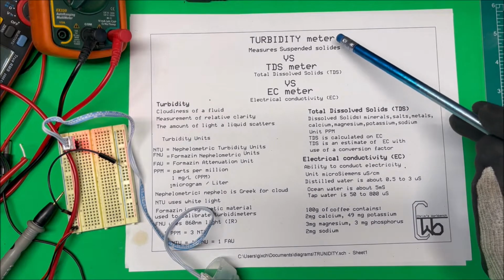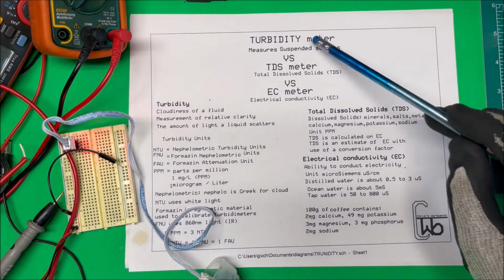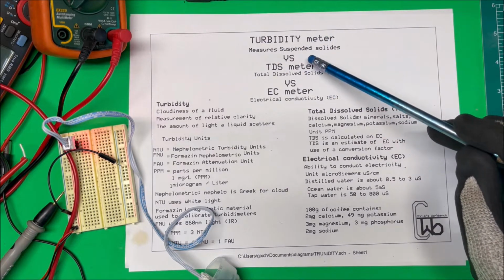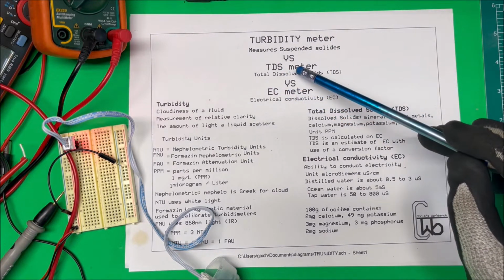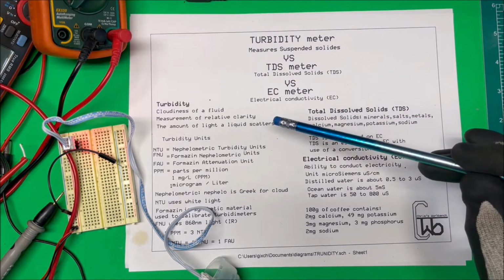Let's talk about turbidity meters versus TDS meters and EC meters. Now, a turbidity meter measures the suspended solids. A TDS meter measures the total dissolved solids, and an EC meter just measures the electrical conductivity.